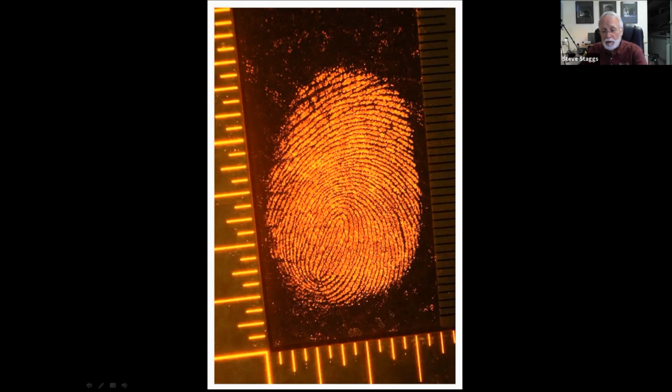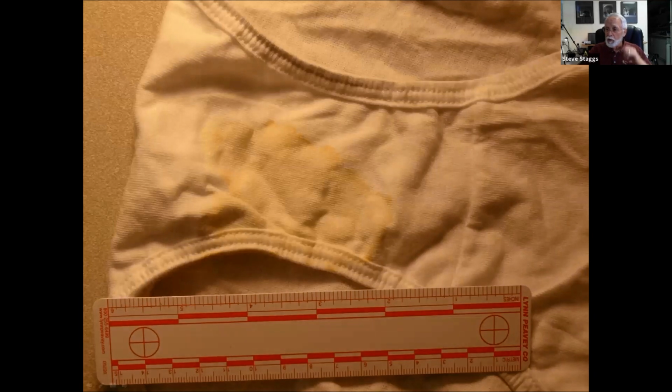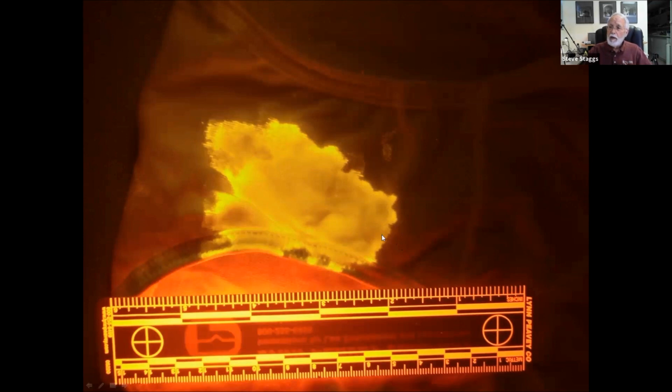Another place that we use the alternate light source is to find body fluids at a crime scene or on our evidence. So here is a photograph of some underwear. And we can kind of tell there's a stain here. But if we go ahead and hit it with the alternate light source and use the orange barrier filter, this is the actual result that we will then see. This is with semen. With urine, it's fainter. Saliva, very faint. But semen does fluoresce quite readily.